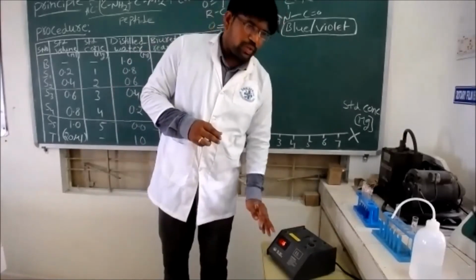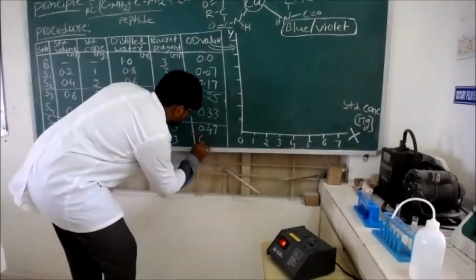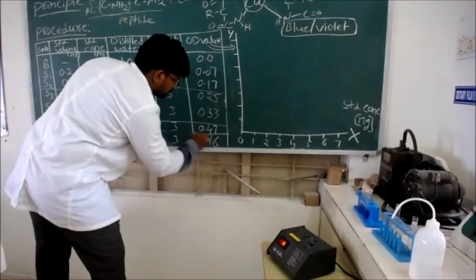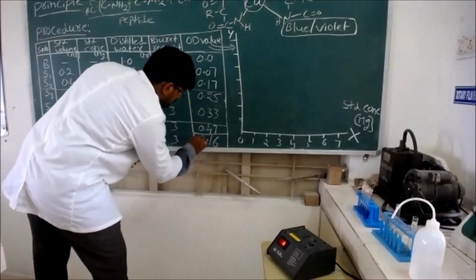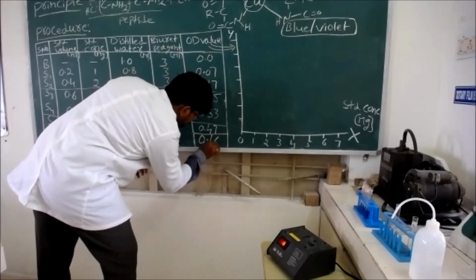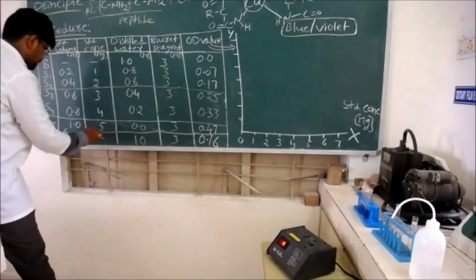The test absorbance is 0.16. Note that down in the table.